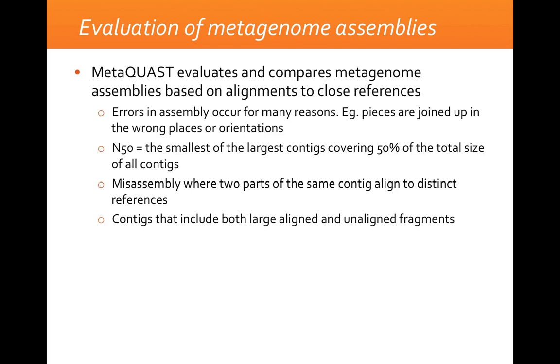Now, MetaQuast is really nice in the way that if you feed it an assembly, it will try to look up what kind of species are in your contigs.